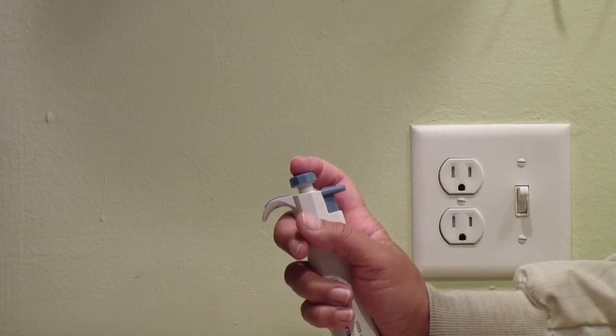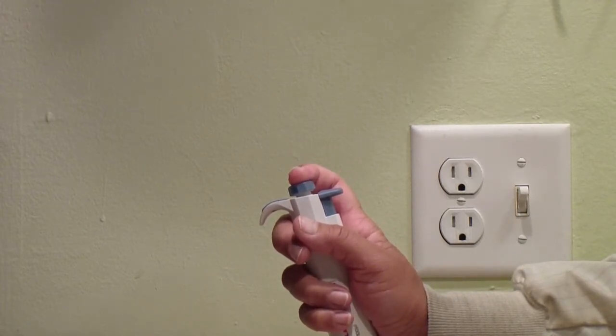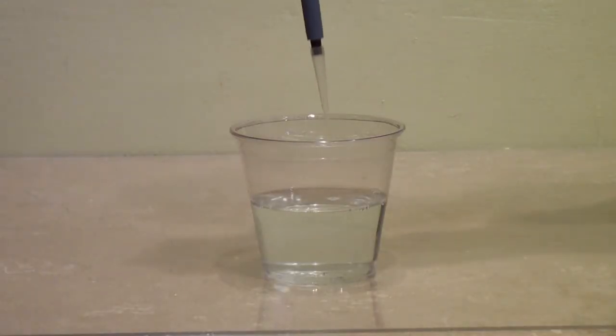So, hold the pipette in the air, press the plunger down to the first stop and hold it there, and then place the end of the tip in the liquid.